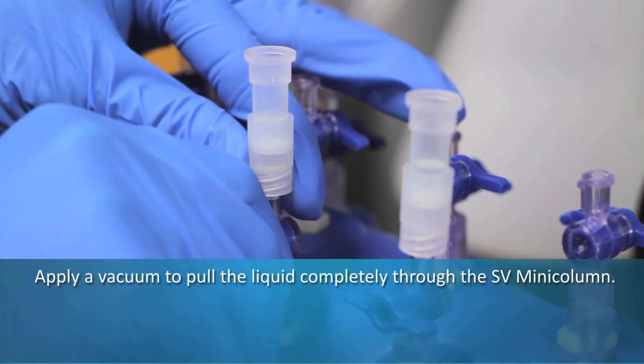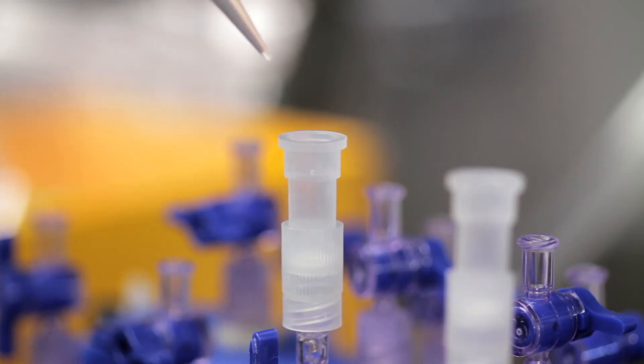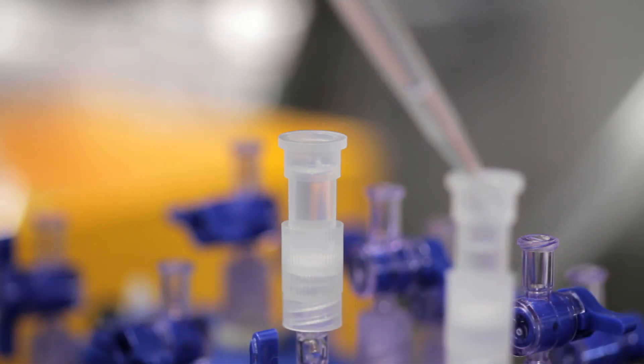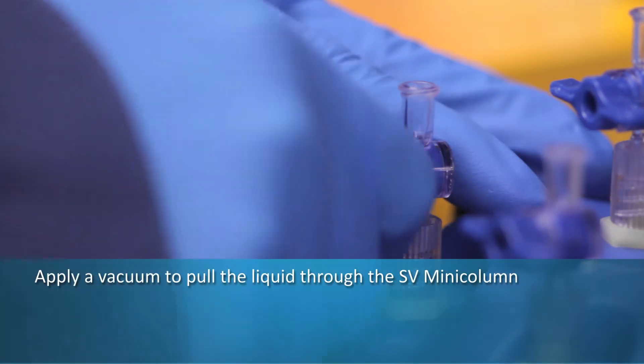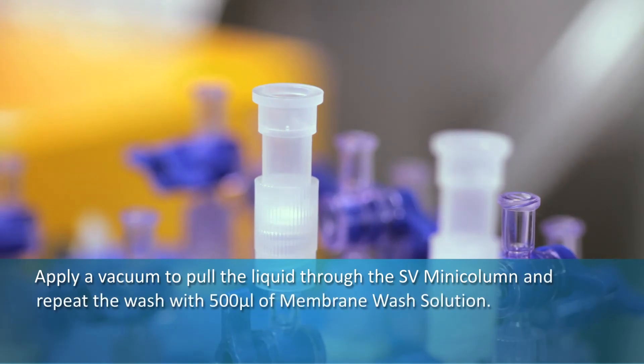Apply a vacuum to pull the liquid completely through the SV mini column. Wash the column by adding 700 microliters of membrane wash solution, making sure any droplets remaining on the sides of the SV mini column from the previous step are washed away. Apply a vacuum to pull the liquid through the SV mini column.